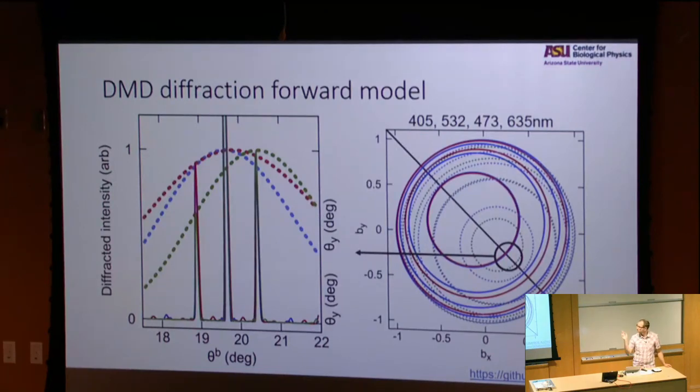And actually for these nanotubes, this is a problem because they will just wander away. So you start imaging and they're there, and then after 3 seconds, just Brownian motion, it's going to diffuse out of the imaging volume, and then poor Frankie has to restart another experiment. If he had a more efficient way of trapping the molecule while letting it still do the Brownian motion he wants it to do, then I think he would be extremely ecstatic, because otherwise it's just a lot of effort on his part.